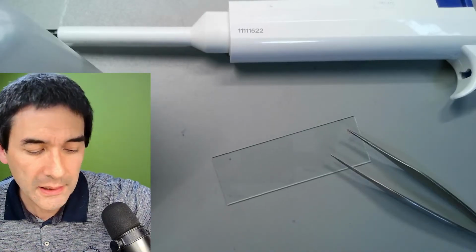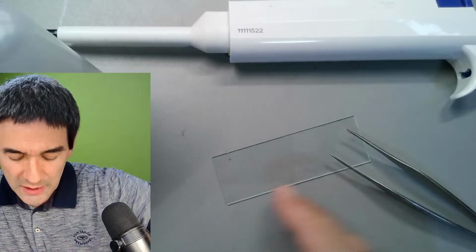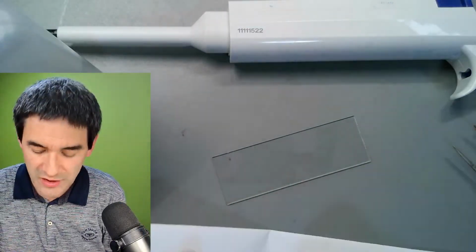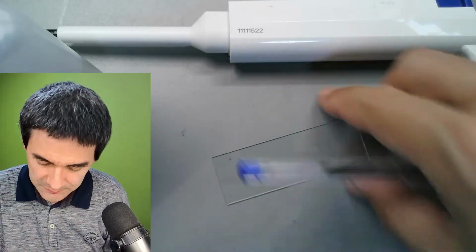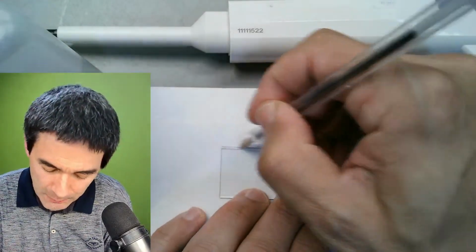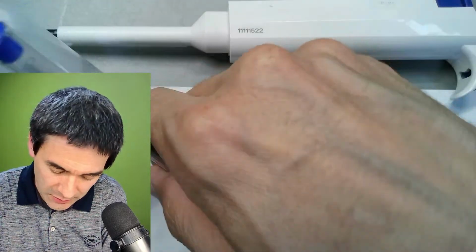So let me get a pen. I nearly forgot that because I want to make sure that everything is properly centered. So look, I'm just going to use this piece of paper here and rip this paper here. Okay, because I do want to make a permanent slide that hopefully will last a little bit longer.